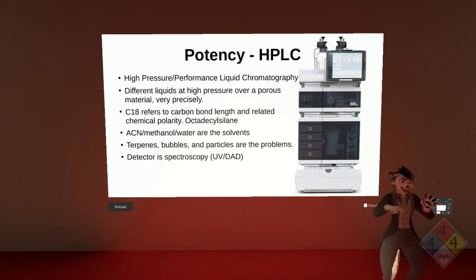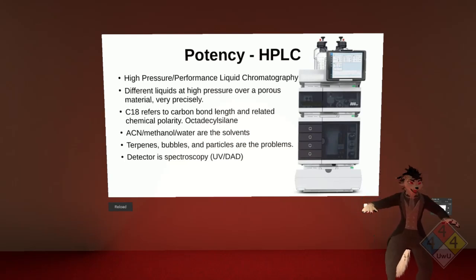Like, let's say 10% steps, where you have 10 steps from 100 to 0%. These guys use some schmancy mechanics to make sure that the gradient is smooth throughout, so you can actually get a pretty precise detail of when it's eluting, which is to say when it's getting off of that absorbent column, and then you actually can get things separated out very efficiently.